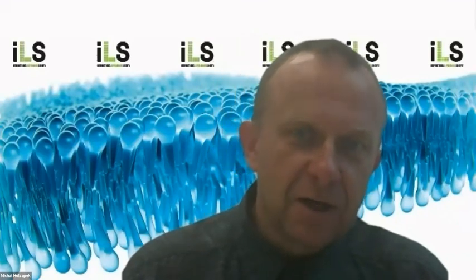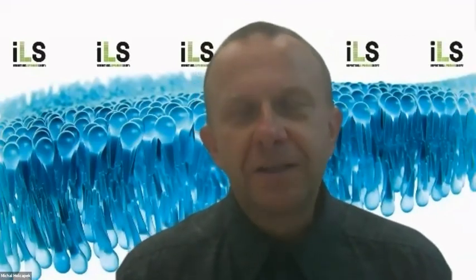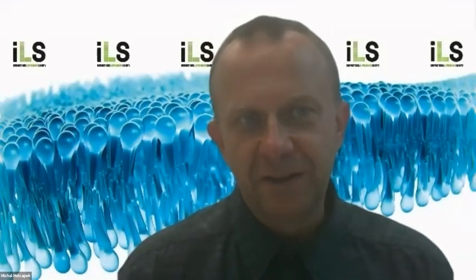So we have published papers on offline coupling of HILIC and reverse phase, online coupling, and at the moment we are working on online coupling of LC and SFC. So this is of course possible, but honestly, I'm not a big fan of two-dimensional approaches, for a simple reason.